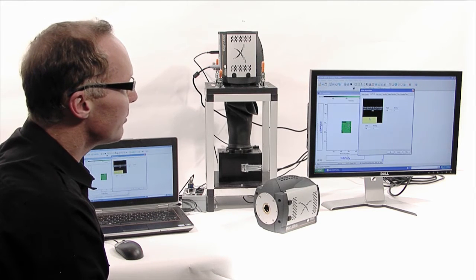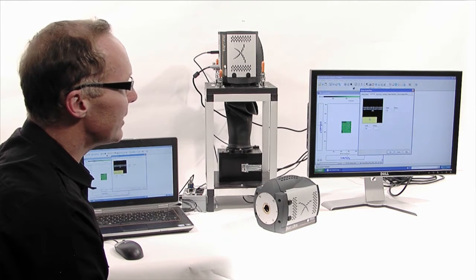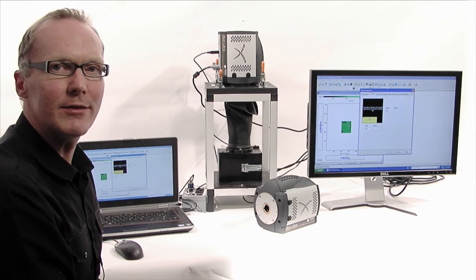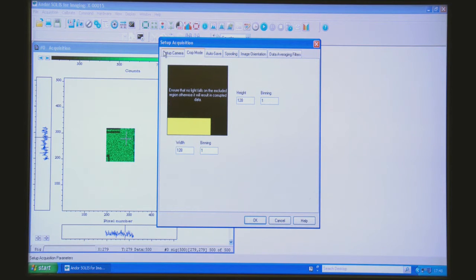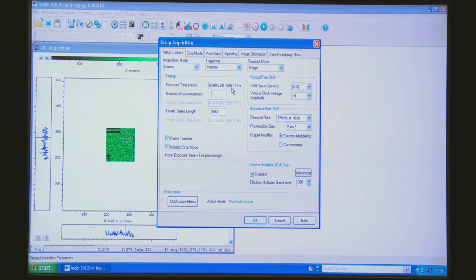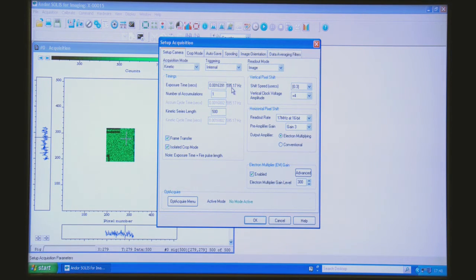From this you can get quite amazing further boosts in frame rate from a region of interest. If you go back to the setup camera you can see the frame rate has now increased to almost 600 frames per second with the same 128x128 subarray.